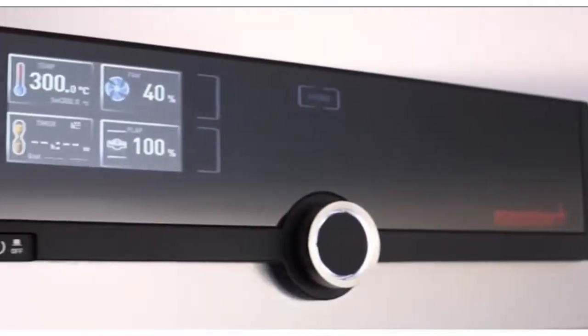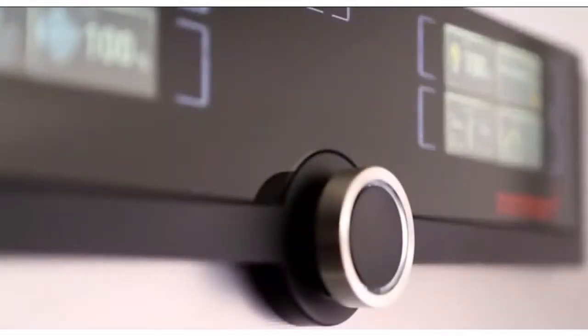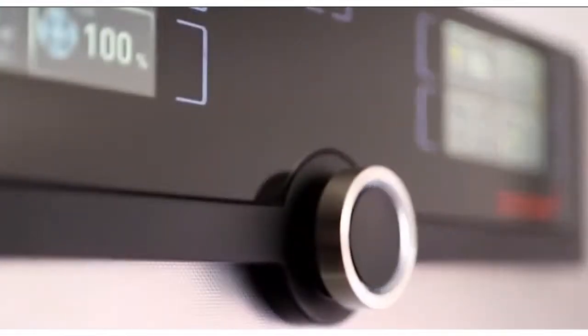Intuitive operation. Fast. Everything in view. The control cockpit of the new generation 2012 appliances gives you time — time for the things that really matter.